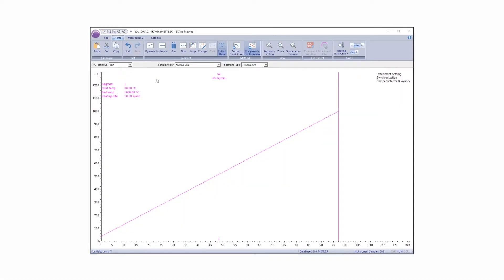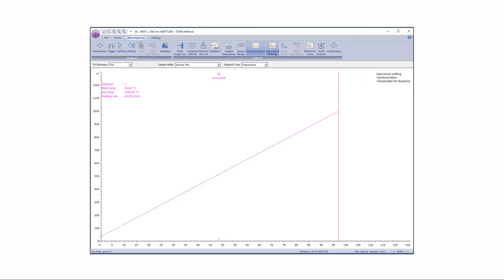Next, define the weigh-in range in the method window. Under the Miscellaneous tab, select Sample Range to specify the sample weight range.